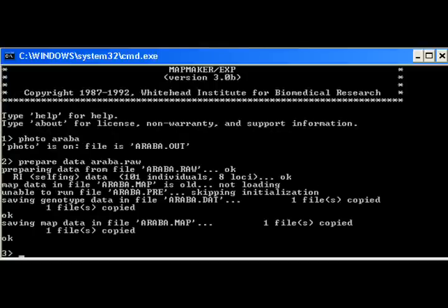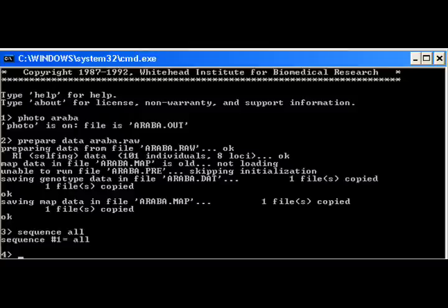Prepare data command prepares the data in the araba.raw file for analysis. Sequence all command tells the Mapmaker to analyze all the loci.